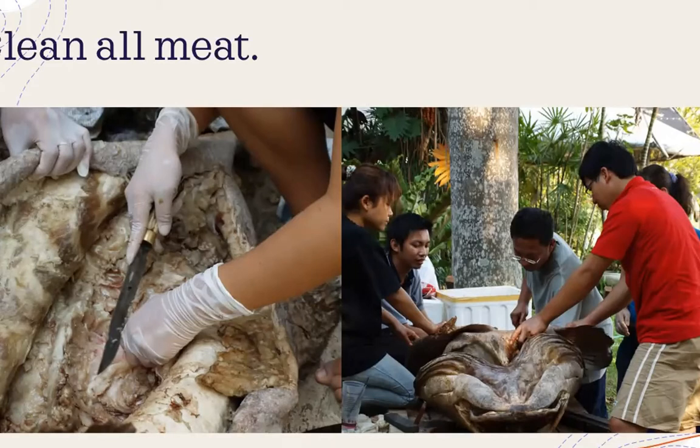You can remember for the anal fin and dorsal fin, we have something like a spine, the proximal spine from the dorsal fin, the anal proximal radial, and also the dorsal proximal radial. Cut it with a very strong knife. The small knife like this one is just for cutting the meat. That's all.